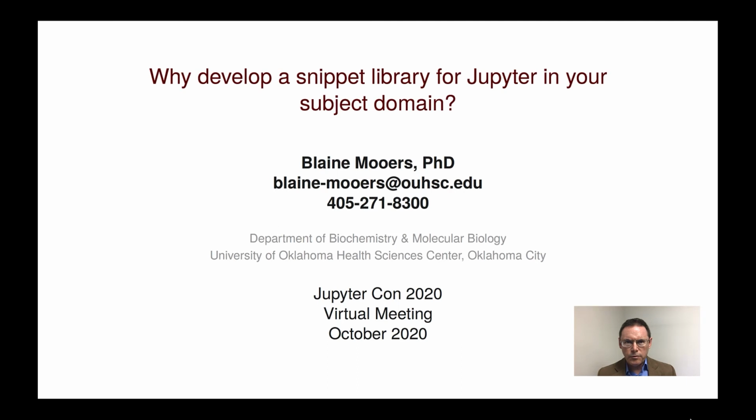I'm Blaine Mooers. I'm an associate professor of biochemistry and molecular biology at the University of Oklahoma Health Sciences Center in Oklahoma City. I'm developing a library of code fragments, or snippets, to ease the use of PyMOL, a powerful molecular graphics program for viewing the molecular structures of proteins and nucleic acids.